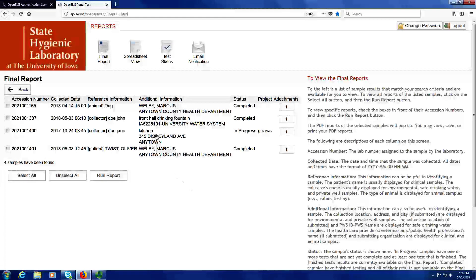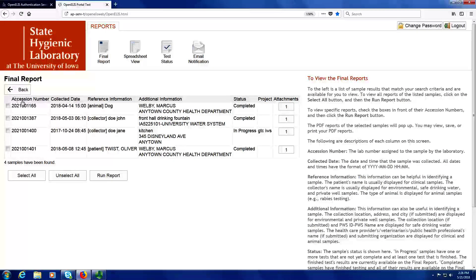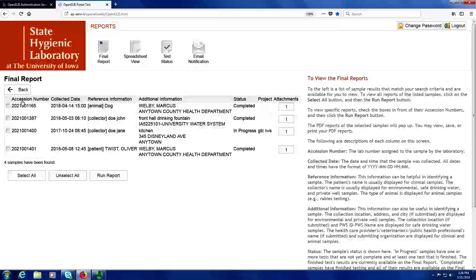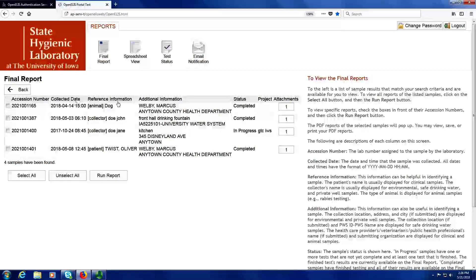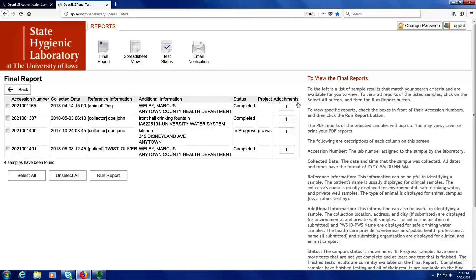Various pieces of information are displayed for each sample. In the first column is the sample's accession number, also called lab number by many labs. This is followed by the collected date and time, reference information, additional information, status, project, and attachments.